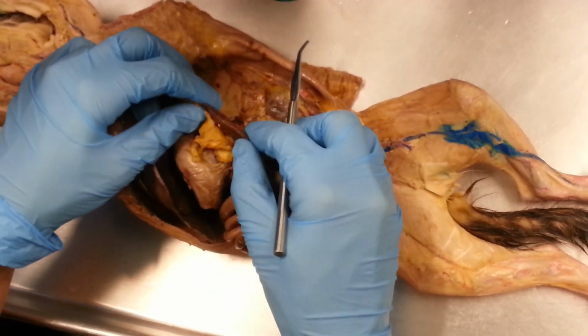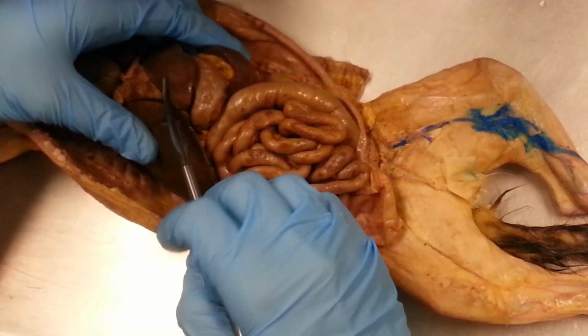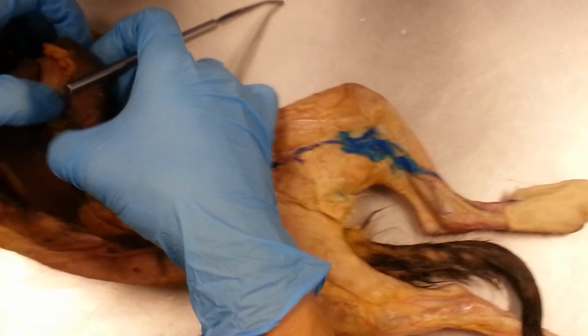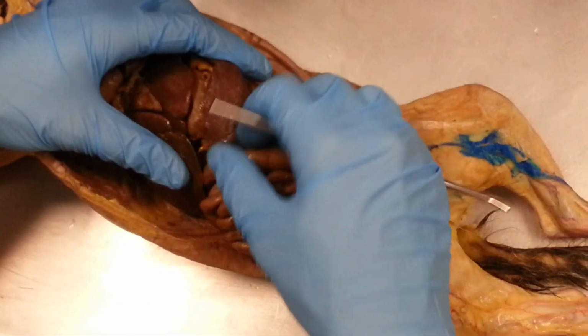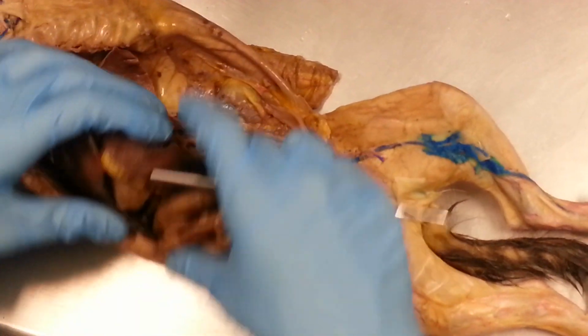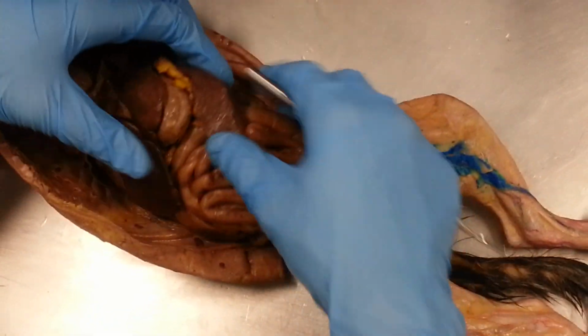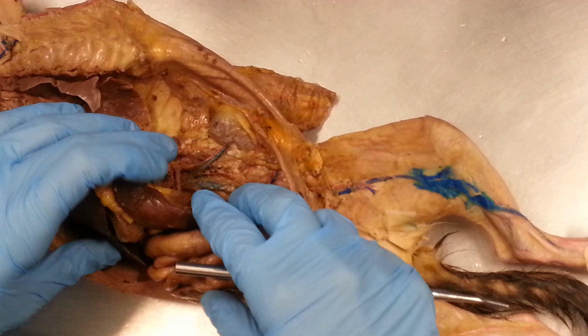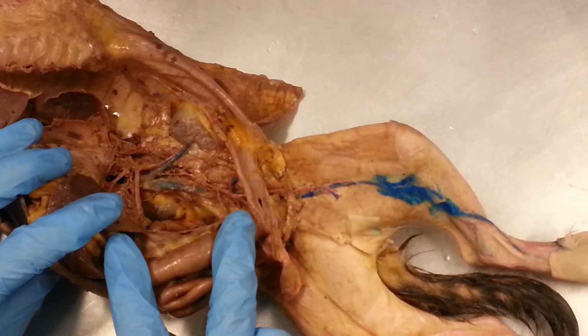This is the spleen. So if I'm intact, my spleen looks like the same tissue as my liver, but it's on the front left of the abdomen. Okay, there's my spleen. It looks like the liver, but it's the spleen underneath. That's right. Well, it's actually positioned in this manner. Okay, gotcha. So you can have like the bottom on its side or whatever? Yep, I'll usually have all of these organs moved out of the way, just like this.